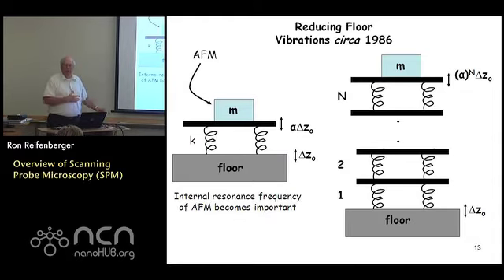So if you build a microscope like this and you just set it on the floor, the vibrations of people walking around, the elevator going up and down, the trucks going back and forth in the street, is going to cause this floor to vibrate by hundreds, if not thousands of nanometers. So how in the world is it possible to hold a tip above a substrate to a precision of a nanometer when the vibrations of the floor which this instrument is sitting on is vibrating by hundreds of nanometers? How do you achieve that? How do you mitigate that floor vibration? Big problem, right? Huge problem.